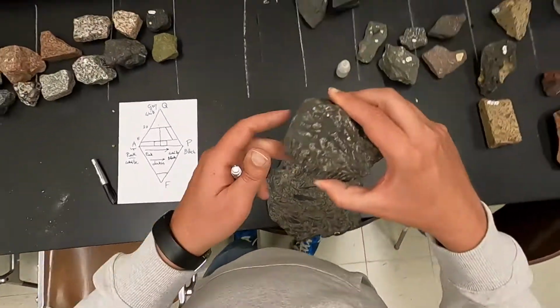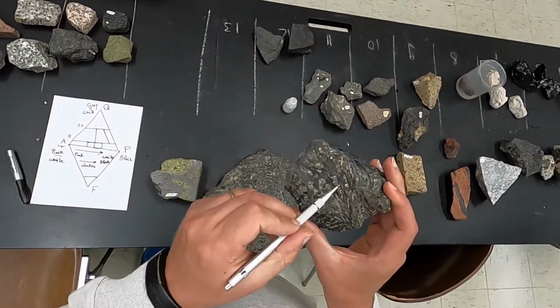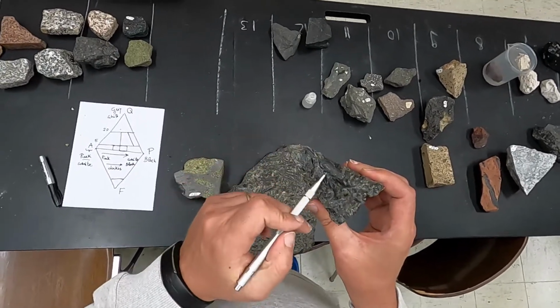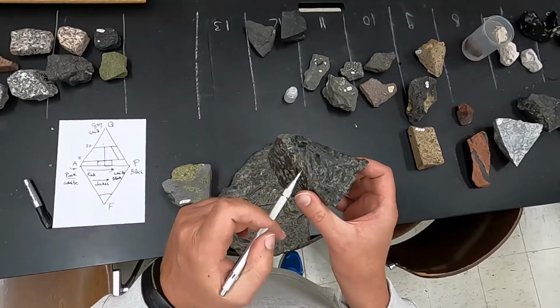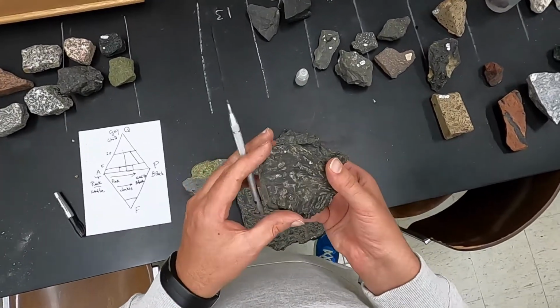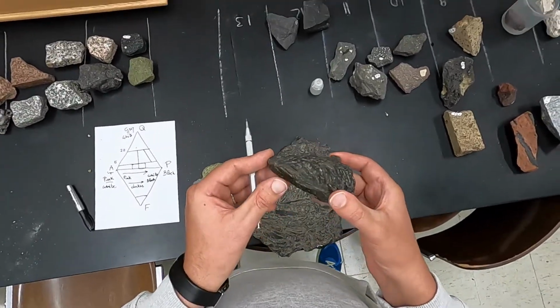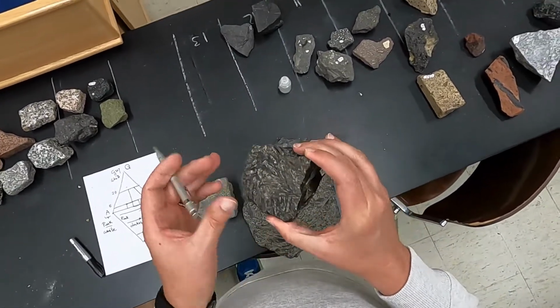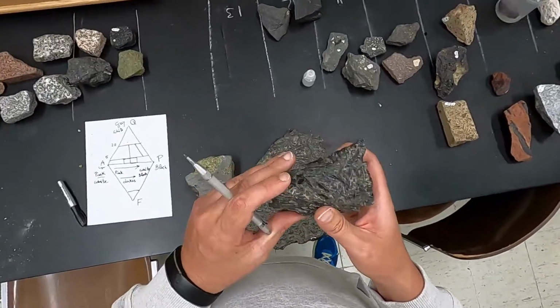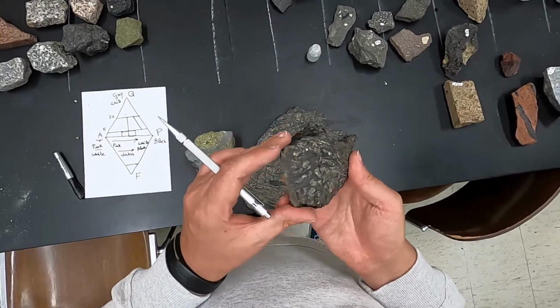You can see here another specimen with these radiated crystals of olivine that have been replaced by likely chlorite. The alteration essentially of the ultramafic rock, or recrystallization potentially during metamorphism of these rocks, will replace the original composition of the olivine, and this is why it gets so dark.